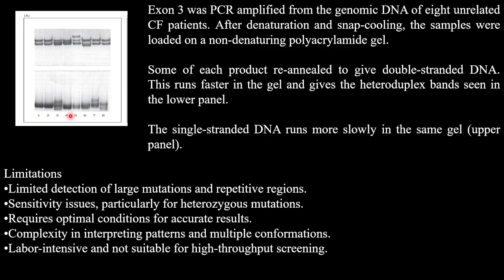You add something by chance, and you can also get a band because of contamination. So it is not a very reliable technique. It requires optimal conditions, and there is complexity in interpreting patterns and multiple conformations. That's a very important point. It is labor intensive and not suitable for high throughput screening.